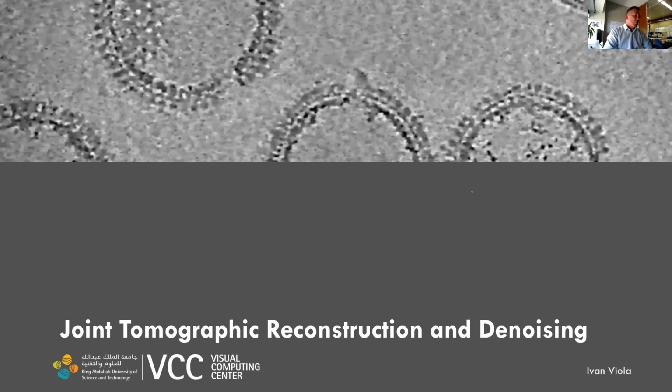But in our case, we have realized that in tomographic reconstruction of cryo-ET data, we have the tilt series information. So we have the original projections, which is quite different from the situation with computed tomography, where typically the scanner will already perform the tomographic reconstruction and access to the original projections is not available.